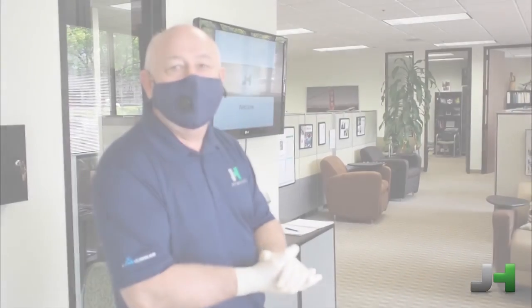Welcome to JH Technologies. We're here during the COVID virus. Wanted to give everybody an opportunity to take a look at what we do in our lab here in Fremont.